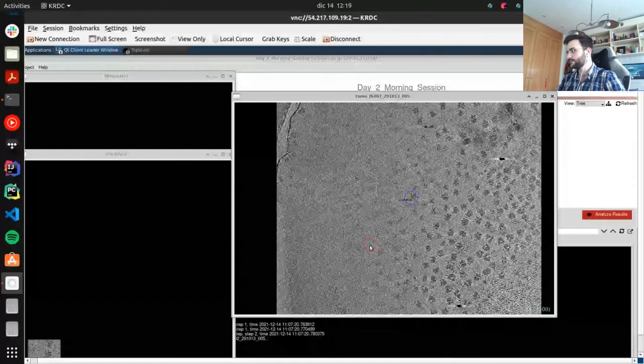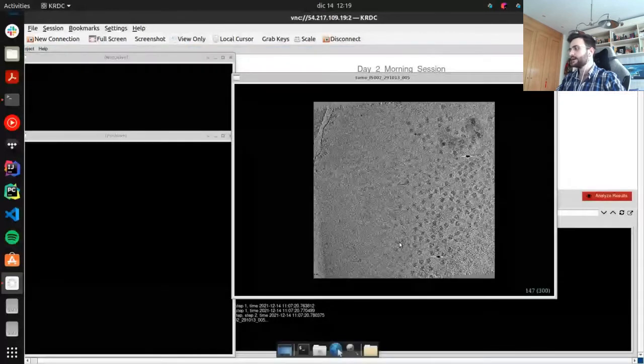Okay, great. So the idea is to pick some positives around. Eman recommends at least 5, but you can pick more. I'm gonna pick, I don't know, around 10, 20, it doesn't matter. As long as it is more than 5, it's gonna be fine. And then we are going to pick also some negatives, which are those regions that we don't care about.